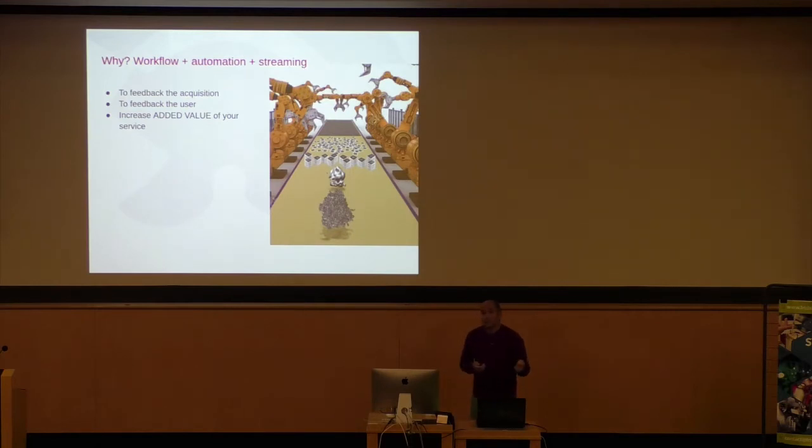So basically using on-the-fly processing will give you feedback. Yeah? So it can give you feedback about your acquisition, and maybe it can help you to make some decisions. Stop the acquisition on that part of the grid, or continue. You're getting nice 2D classes on that part. It will give feedback to the user early in the acquisition as well. And I think it will add value for the facility if you offer the facility as a service. If you provide some online processing capabilities, I think it's another value.